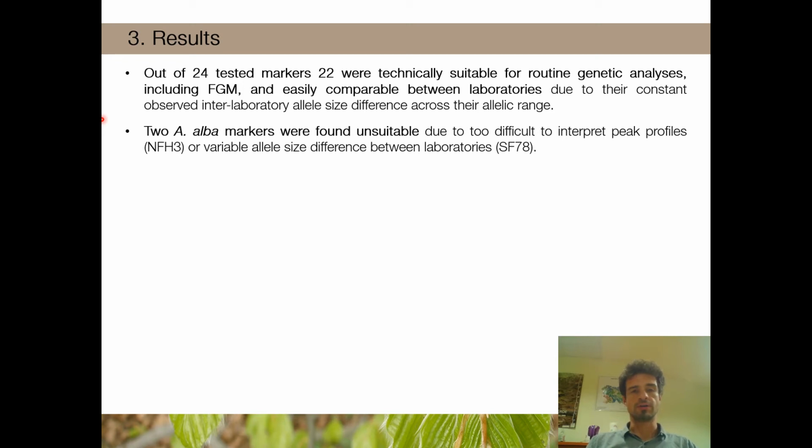Two of the markers for the fir that were tested were found unsuitable because they were either too difficult to interpret or exhibited variable allele size difference between laboratories.